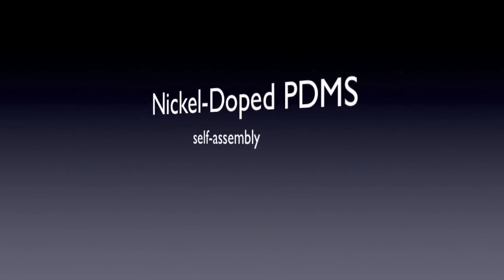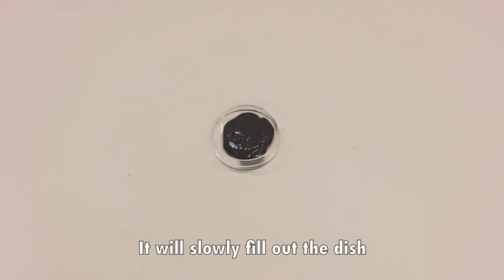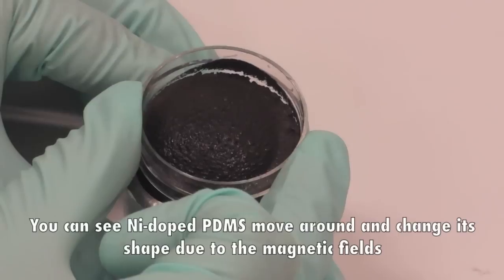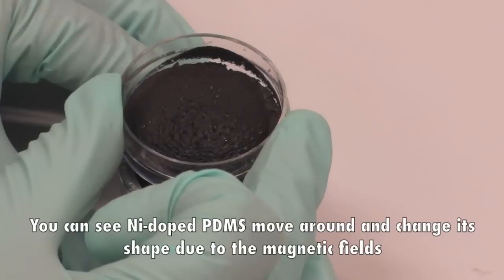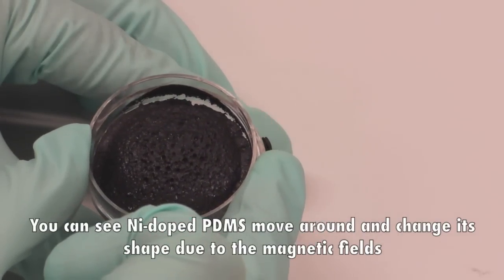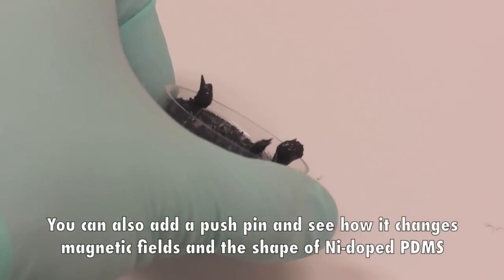Nickel-doped PDMS self-assembling demo: pour nickel-doped PDMS into a pitcher dish and it will slowly fill out the dish. Place the magnet directly underneath the pitcher dish. You can see the nickel-doped PDMS move around and change its shape due to the magnetic field. You can also add a push pin and see how it changes the magnetic field and the shape of the nickel-doped PDMS.